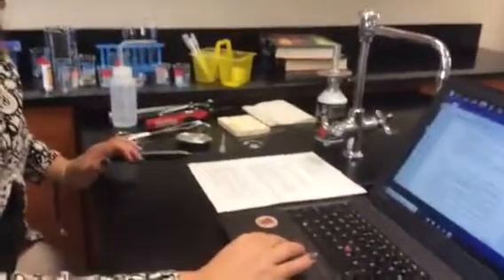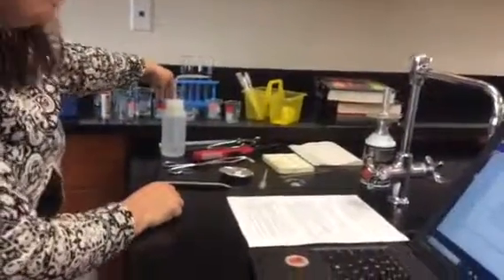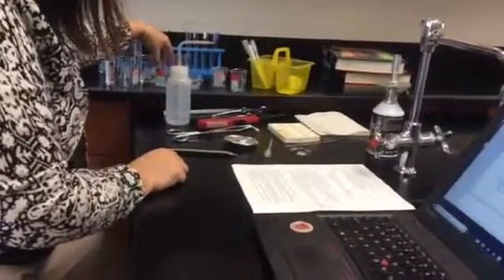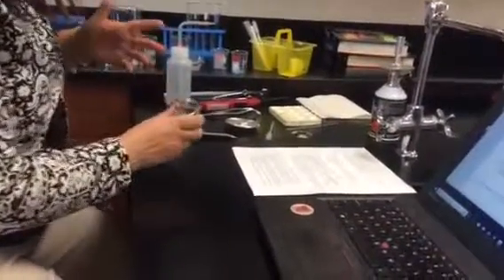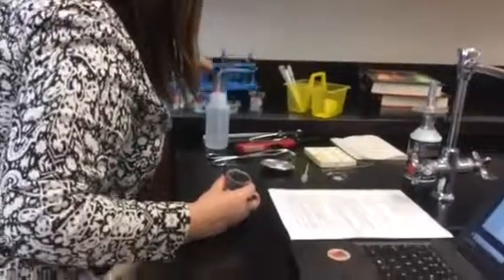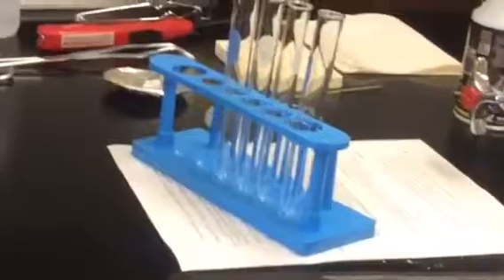All right. Part C, place a small crystal of copper sulfate. Okay, copper II sulfate, and you're going to place this into a test tube. You're only going to use two test tubes, but each of parts 2, 4, and 6 needs them. It's not an actual crystal, it's more like powder, but you just want about that much, and it's not a big deal.